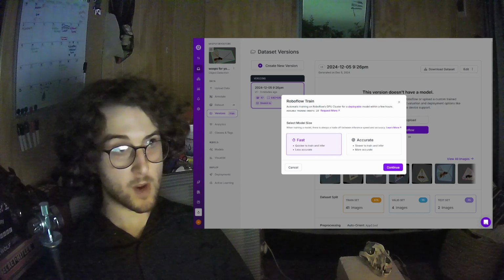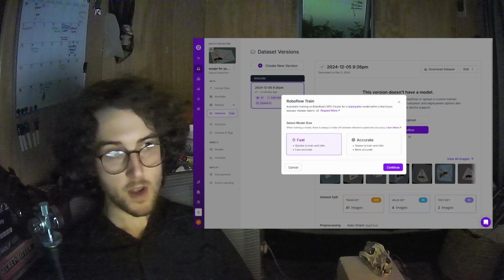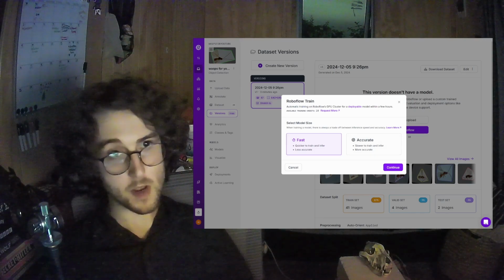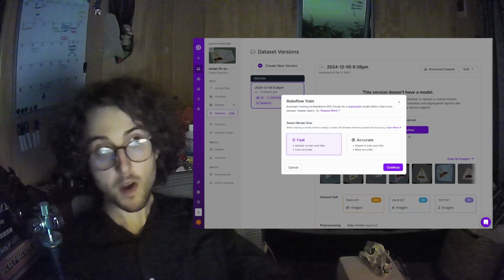And I'm going to have the option to choose between fast and accurate. I think accuracy is usually good. It's usually worth taking a bit more time to get better data. But for the purposes of this video, I'll go with the fast option. For you, choose which one suits you.